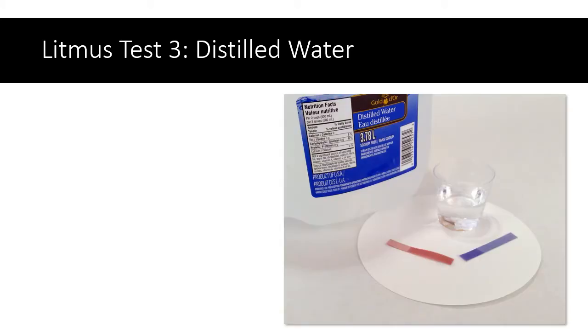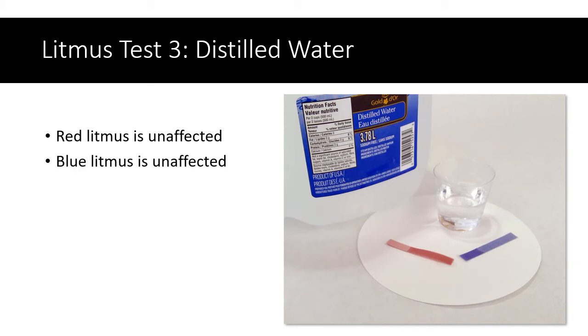Test three — let's just use some pure distilled water. Here you can see that the red litmus stayed red and the blue litmus stayed blue. In other words, distilled water doesn't seem to have any effect on litmus paper.